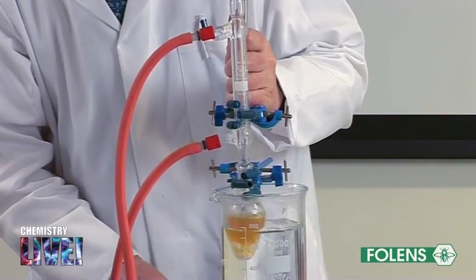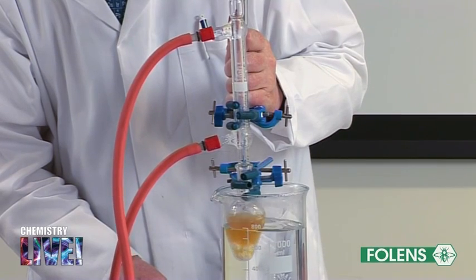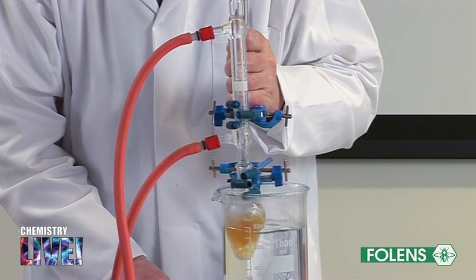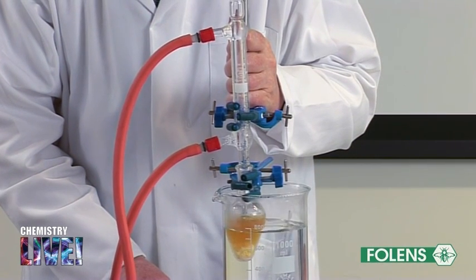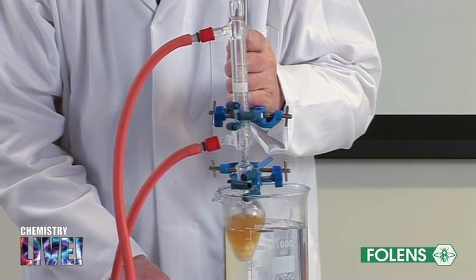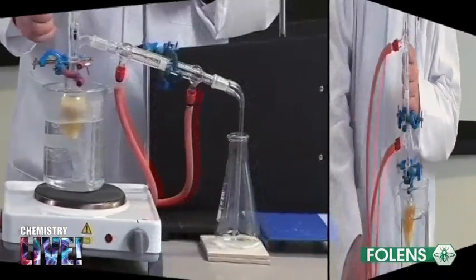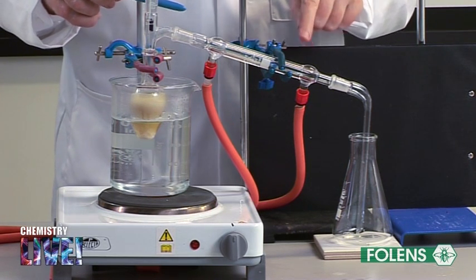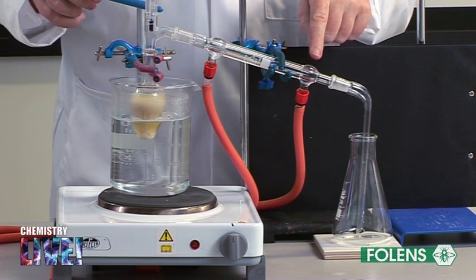After the end of the 30-minute period, saponification should be complete. Allow the apparatus to cool and rearrange it for distillation. We are now going to distill off most of the ethanol solvent. This will make it easier for us to isolate the soap.